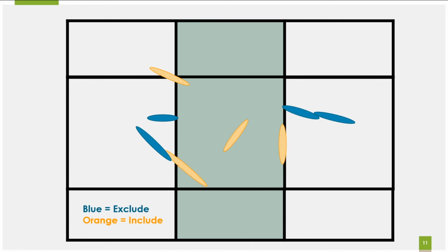If you're doing it one way, do it that way the entire time you're counting, and for every sample that you're counting. You want to be consistent. The way that I do this is that if it's in the column like this, so if we're counting this gray column here, if it's in the column like this orange cell, of course we're going to count it. If it's partially in like this orange cell, of course we're going to count it.